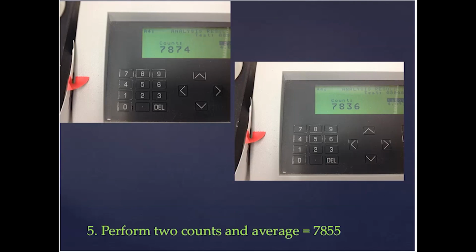At the end of the count, here's a number, 7874. What we do is hit start again and perform a second count. Hopefully the two counts are kind of close, within 10%. It's usually the criterion that I use. You take the two counts, and if they're within 10%, you can average, and our average count here is 7855.